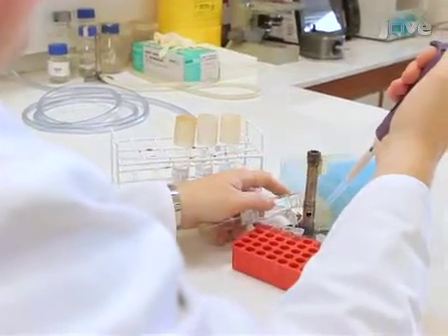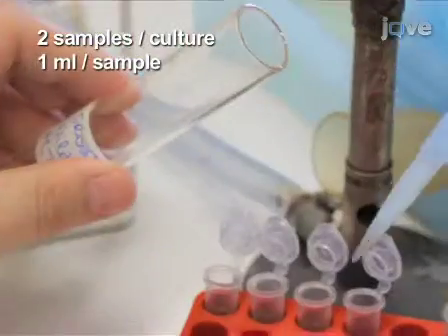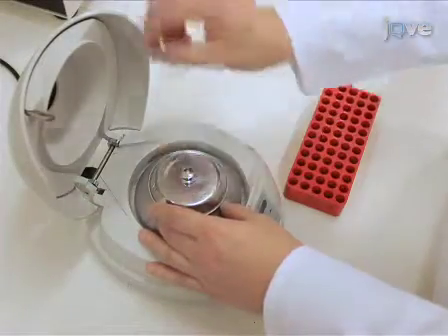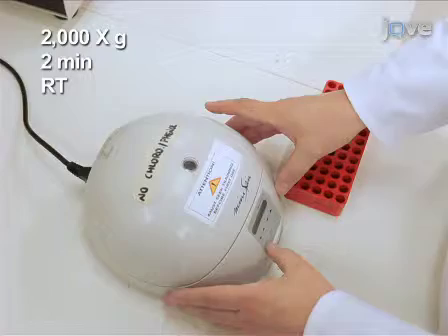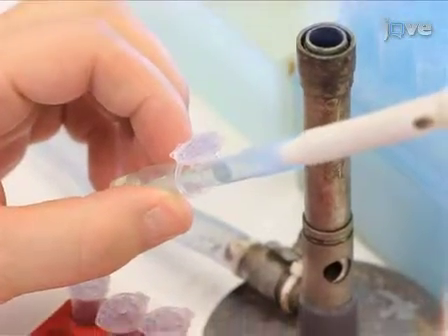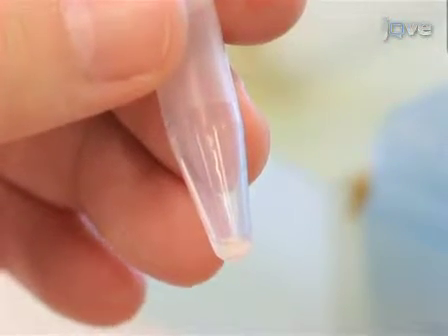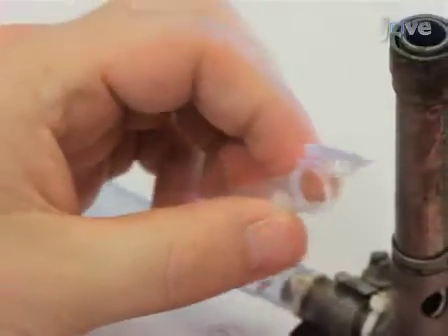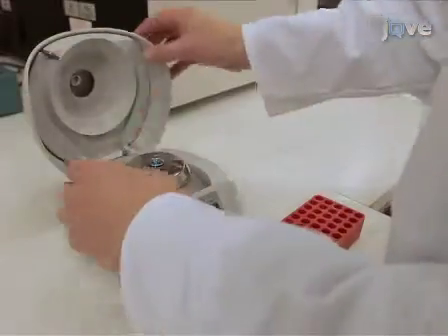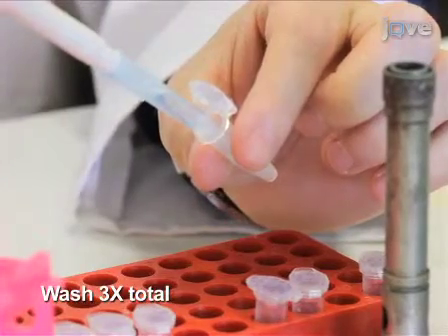At the end of the incubation period, transfer two 1-milliliter samples of each culture into 1.7-milliliter snap-cap plastic centrifuge tubes. Gently pellet the cells by centrifugation at low speed. After centrifugation, carefully remove and discard the supernatant from each tube without disturbing the cell pellet. Wash the cells with 1 milliliter of sterile distilled water by resuspension, followed by centrifugation. Repeat the wash two more times to remove residual medium.